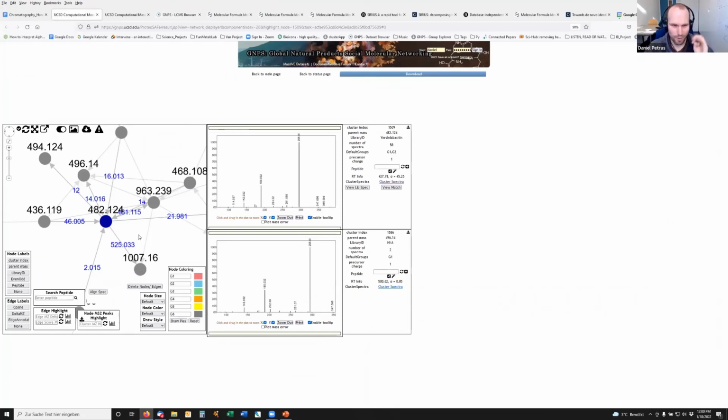And that's, I think, a perfect example why it is important to also look at the chromatograms. Because here, and maybe somebody can give a suggestion or an idea what this could be, but apparently there's more than one form of Yersinia bactin. So any idea why we could have two peaks there? Isomer. Mm-hmm.